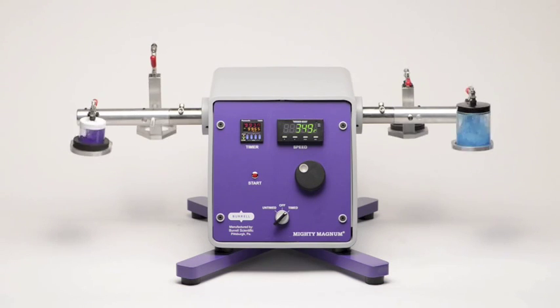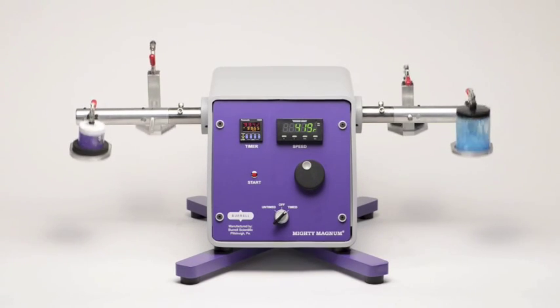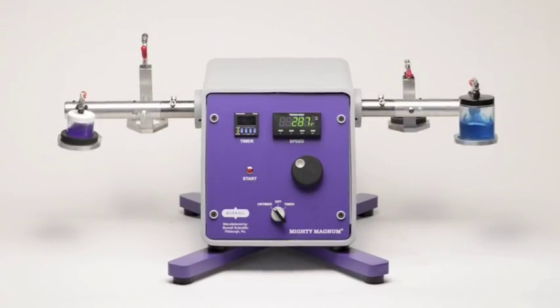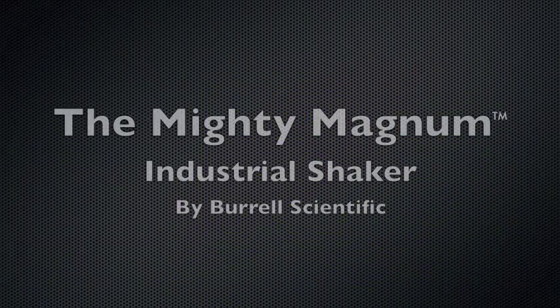The Magnum can be used on a bench top or sit on the floor. The Magnum shaker can use basic shafts and clamps or custom snap-and-lock clamps. If you need heavy-duty shaking, we have what you're looking for — the mighty Magnum shaker from Borel Scientific.